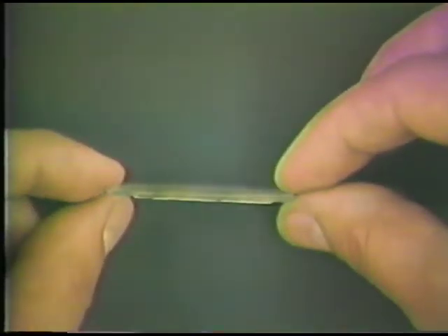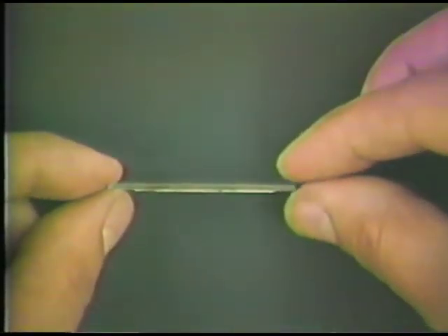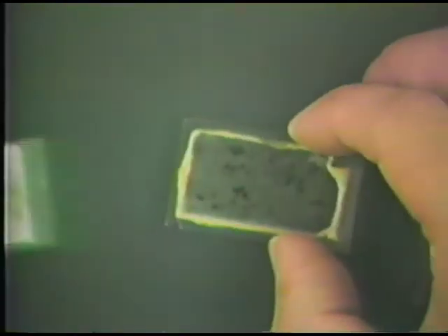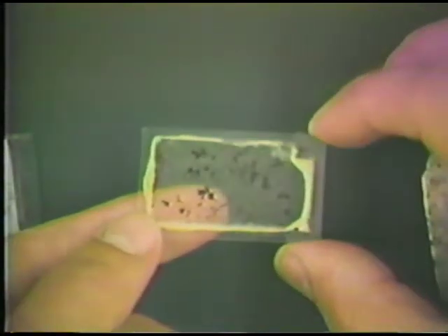And here's another example. The same rock now has been ground to a very thin thickness. It's less than a millimeter thick now, but still it's opaque. You can't see through it at this particular stage, so it takes a bit more grinding still until you get the transparency that we see in the final thin section.